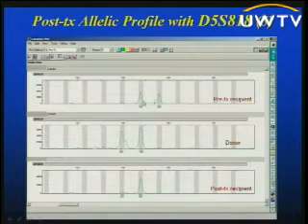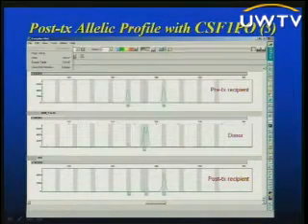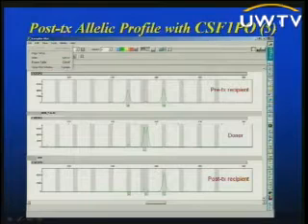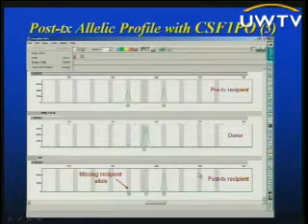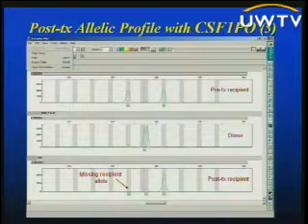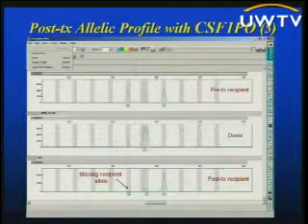So you can see pre-transplant there were 2 peaks, and the donor has 2 nice peaks, and then post-transplant again there's a missing allele. This is another one of the loci that sits on chromosome 5, and you see the exact same thing occurring. There's a missing recipient allele. And this can be a problem, especially if you have donor alleles that are coincident with the recipient alleles. You can miscall the percentage of donor and recipient, making it imperative that we constantly check to make sure that everything fits and all the results we get actually talk to each other. And there's consistency.